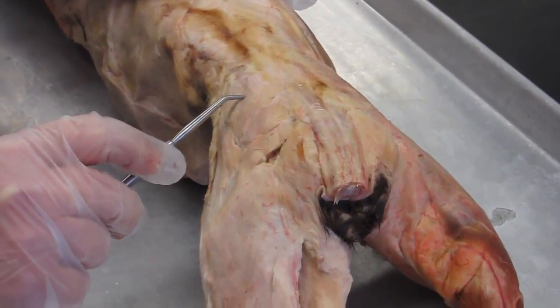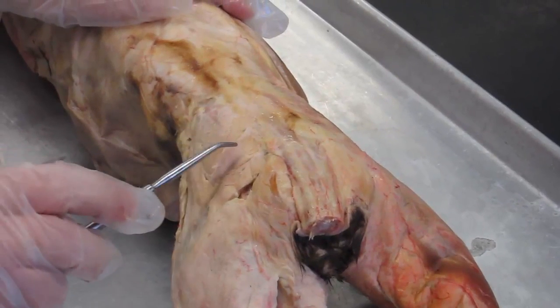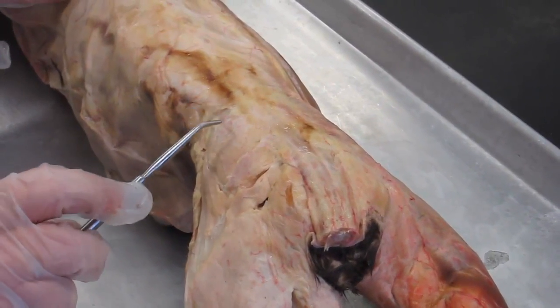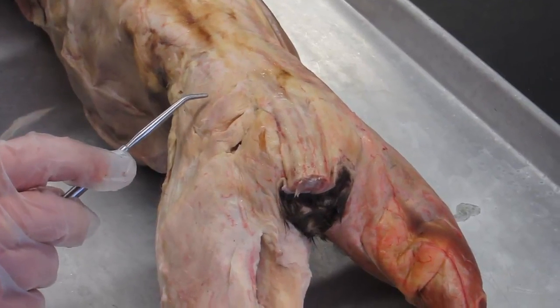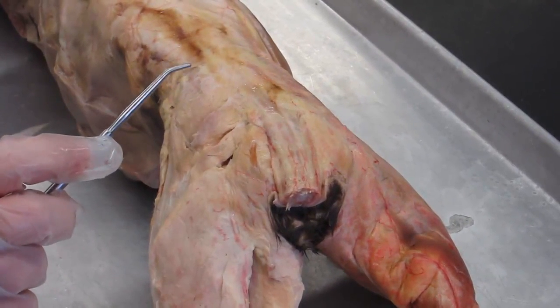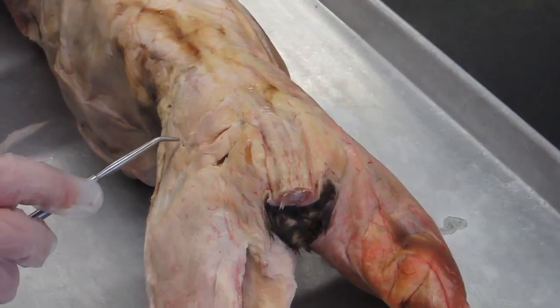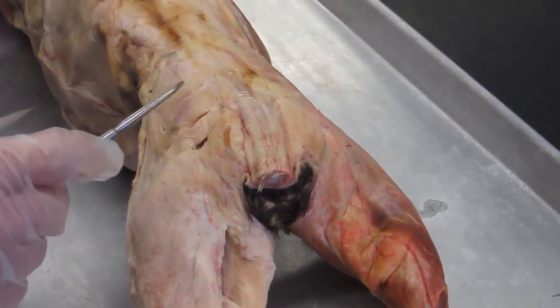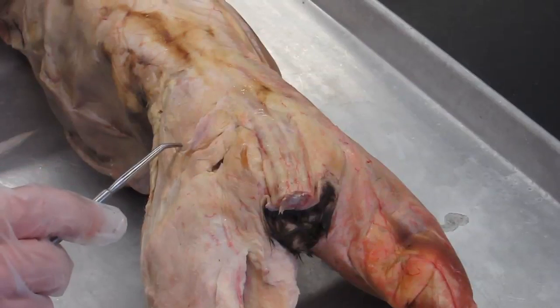These are the gluteal muscles. We have the gluteus medius and the gluteus maximus. The cat arrangement of the gluteus medius and maximus is different than the human arrangement — this is one of the differences between the cat and the human. In humans, the gluteus maximus is the larger of the two muscles, and it completely covers the gluteus medius, especially on its medial side, so you really have to reflect the gluteus maximus to see all of the gluteus medius.